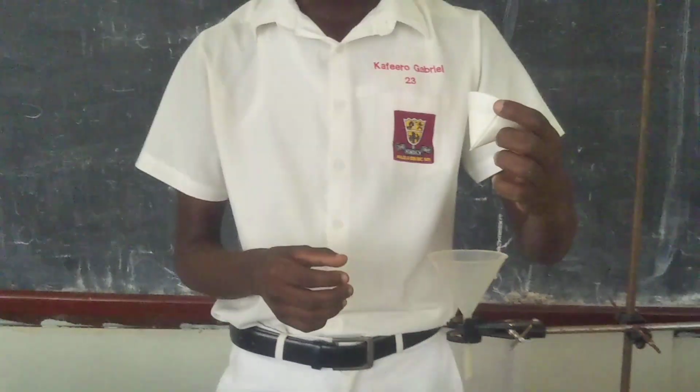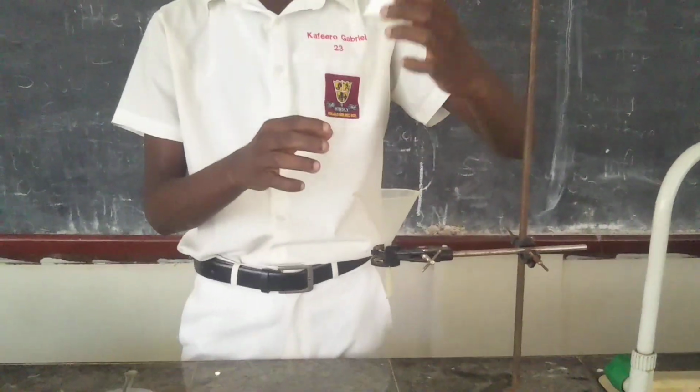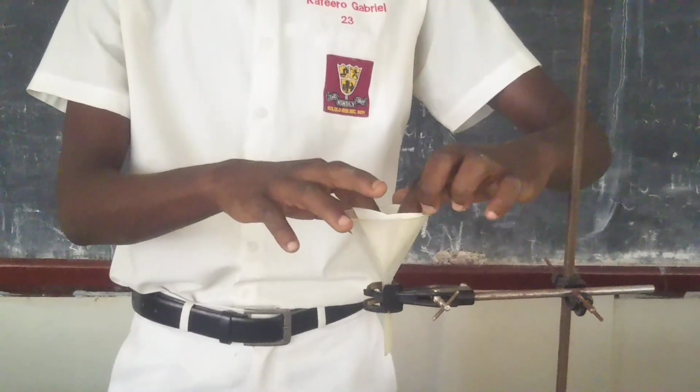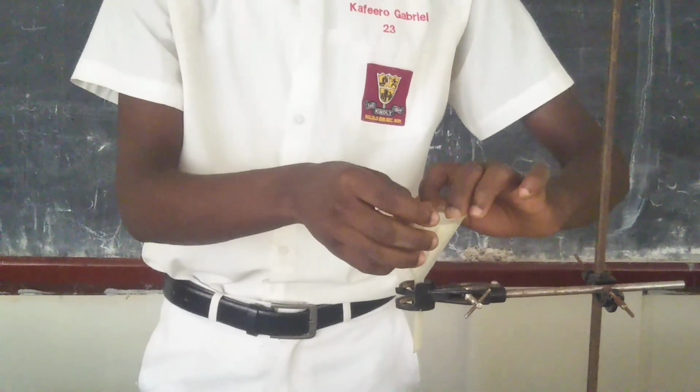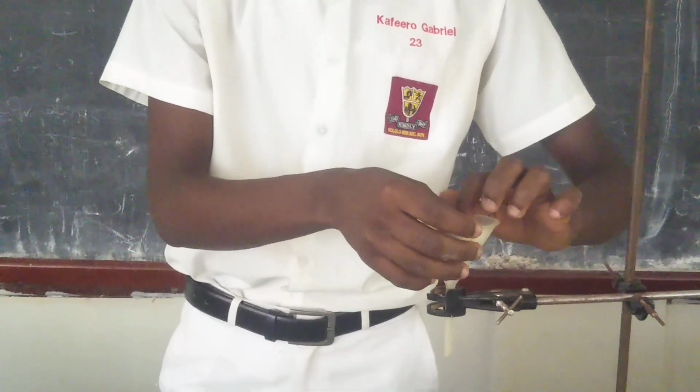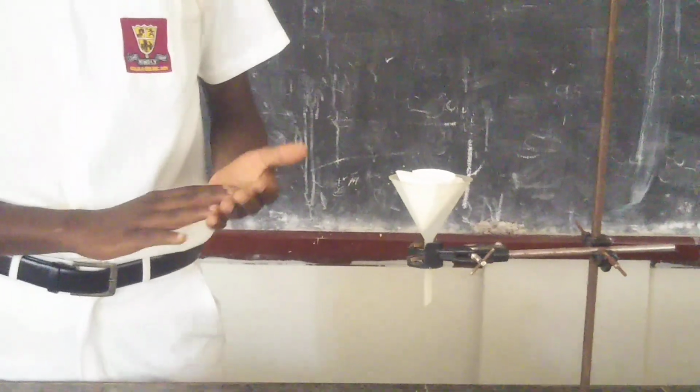Now, after opening it, what I need to do is place this into our funnel. So I will place it into our funnel, as you see. We make sure that it's properly fixed. There it is, it's all fixed here in our funnel.